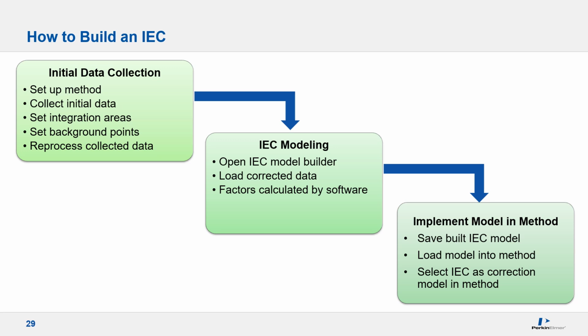Unlike the MSF model, once all these samples and standards have been analyzed, you will need to set background points and integration areas in the examine window. The success of your IEC model is going to be heavily dependent on the positioning of the background points and integration areas. Also, remember that IEC correction factors are highly dependent on plasma and sample uptake conditions. You must run your blank and single element standards using the sample introduction conditions you plan to use for the analysis.